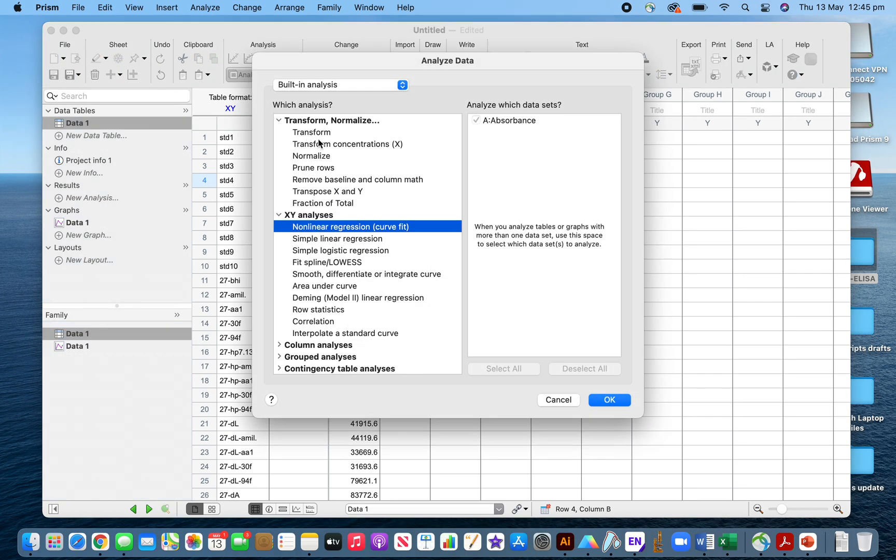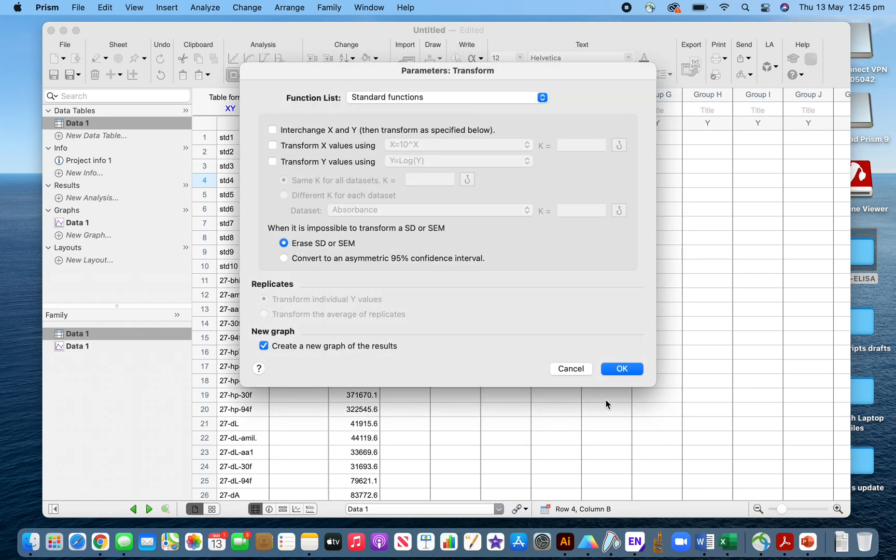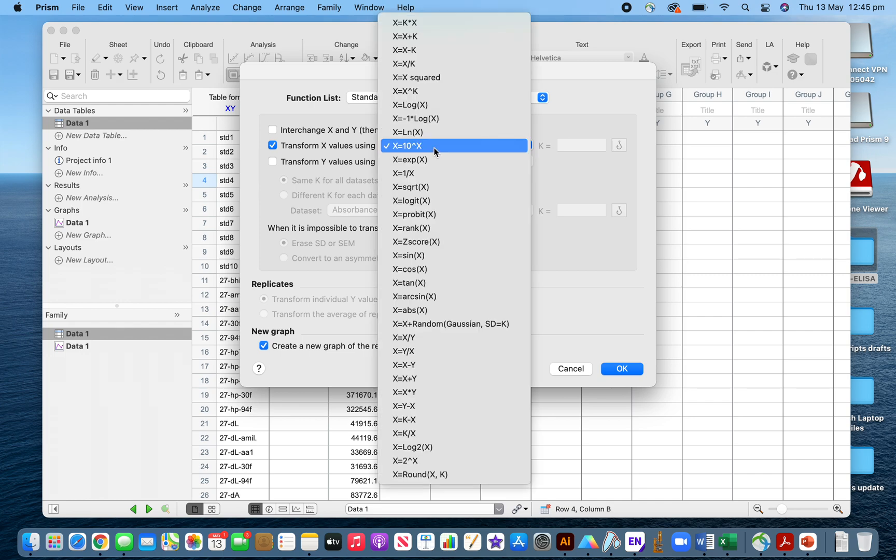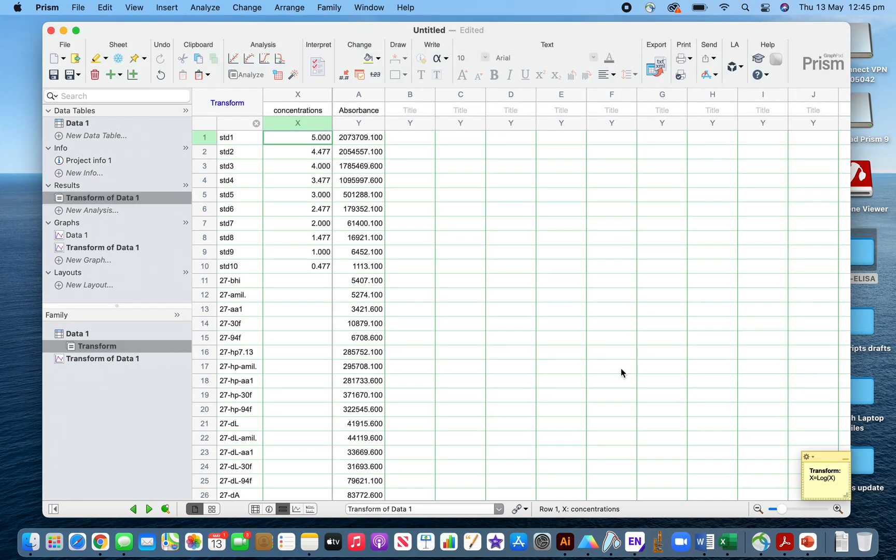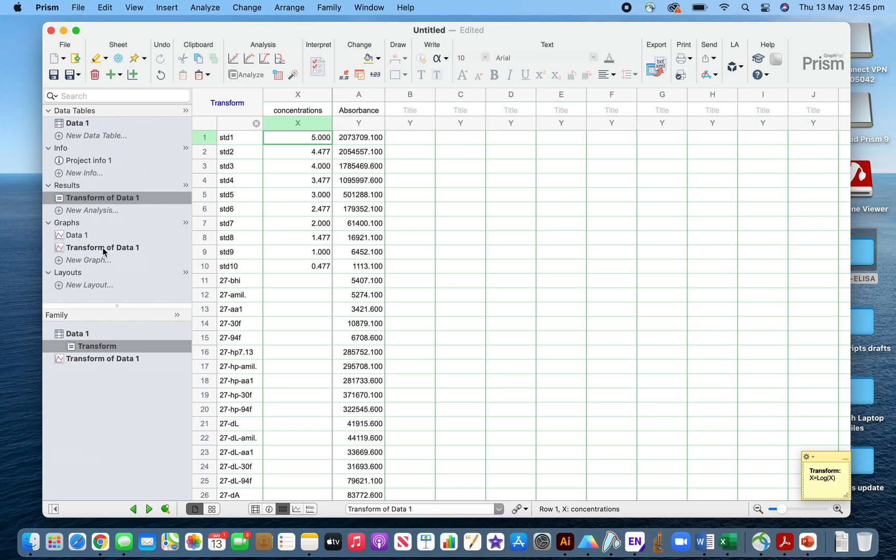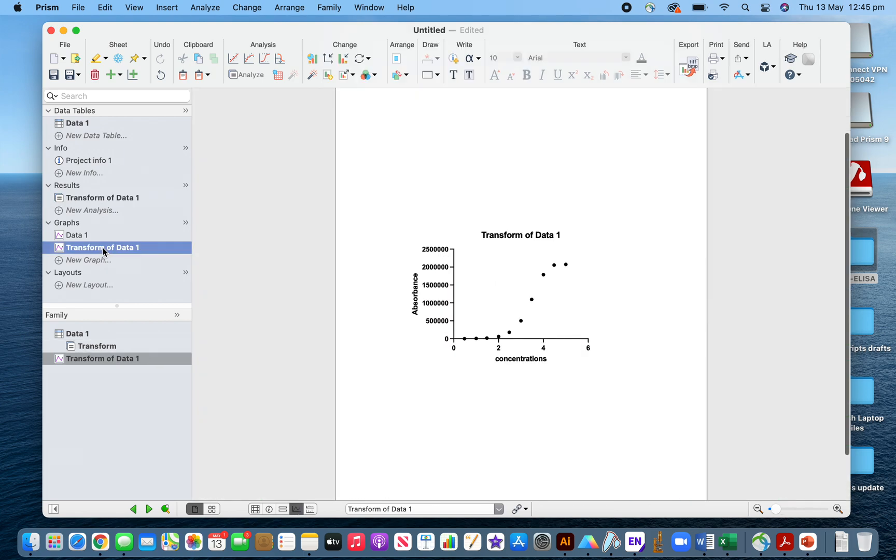For that you have to go to Analyze, Transform, and then transform x using log10 transformation. After that I'll click OK. I got my transformed concentrations here.